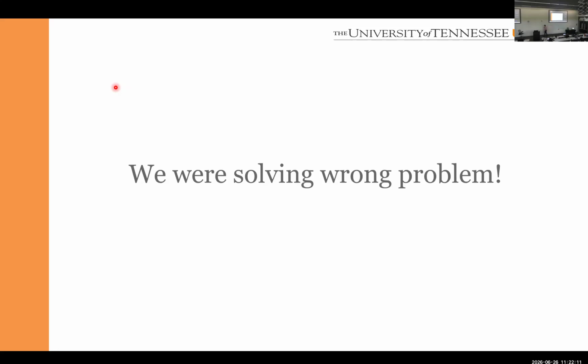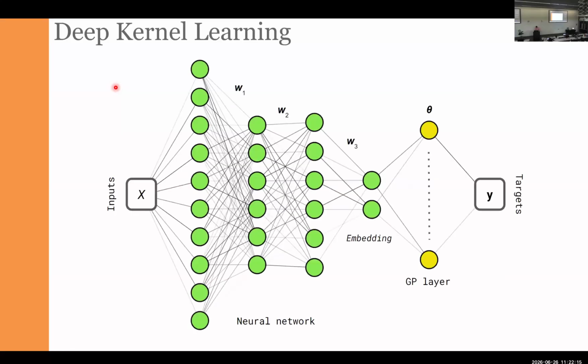However, what is important is that we realize that we were solving the wrong problem, because practically we don't have the problem of finding the image. So almost always the standard rectangular scanning is close to optimal. It can be improved, and both our groups and several groups in Europe worked on better scanning patterns.